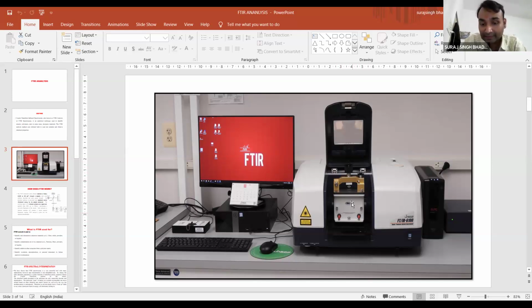After placing this sample over the lens, you have to analyze it under the IR spectroscopy, through which you can determine the various functional groups. So this is a general setup of IR spectroscopy, and it is generally easily available in any type of analytical lab, whether you talk about qualitative or quantitative analysis and the determination of various functional groups in our compounds.